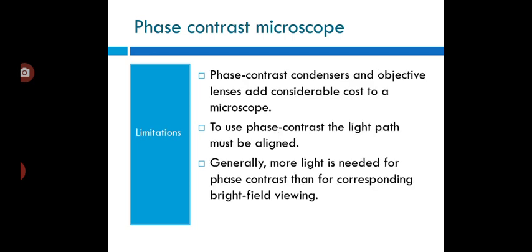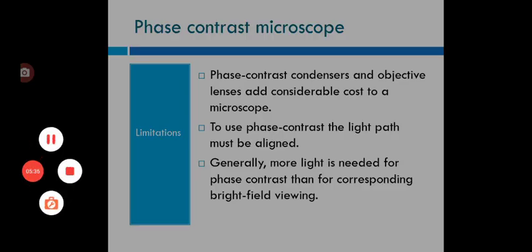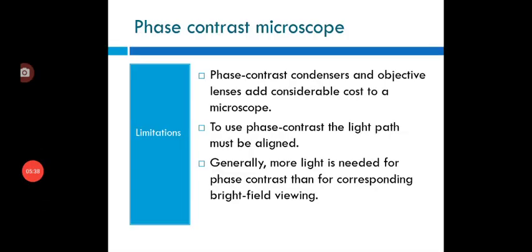Next, coming to the limitations of the phase contrast microscope. Here the phase contrast condenser and objective lenses add considerable cost to a microscope, and so phase contrast is often not used in teaching labs except perhaps in classes in the health professions.